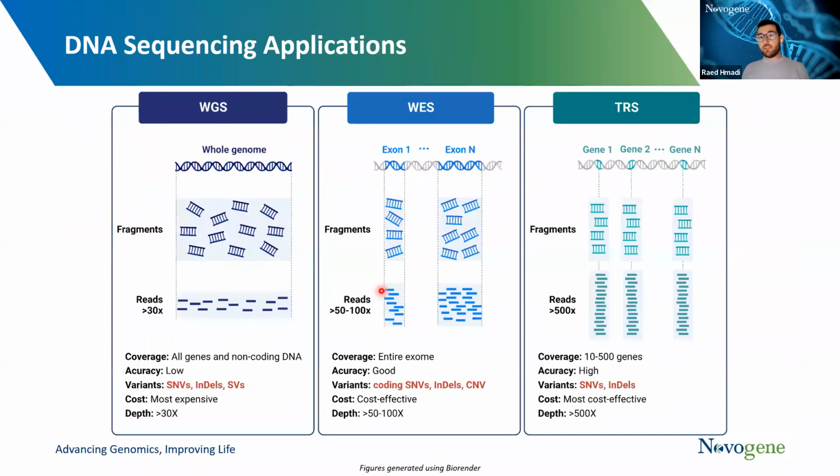In terms of advantages compared to Sanger sequencing, with target region sequencing, the sample requirements are less. So this is one of the main advantages. And in addition, we are actually providing data with higher accuracy since the coverage will be at least 500x for those genes or regions that we have decided to sequence. So the coverage is very high, and this would eliminate the possibility of any errors or mismatches that might have happened. And at the same time, we require less amounts compared to Sanger.